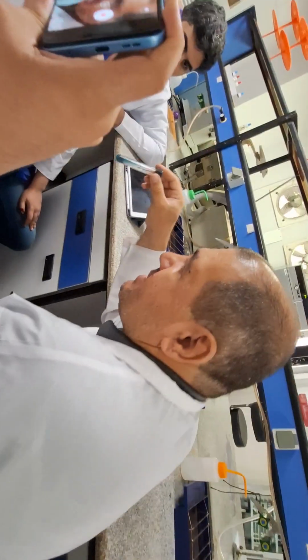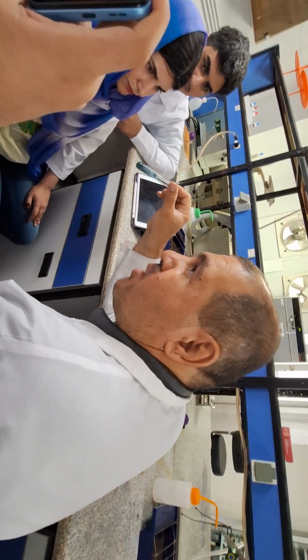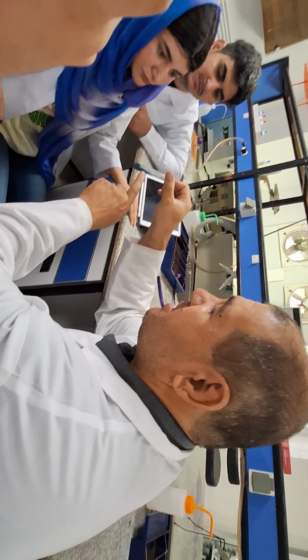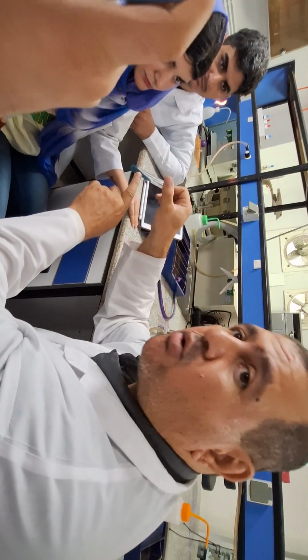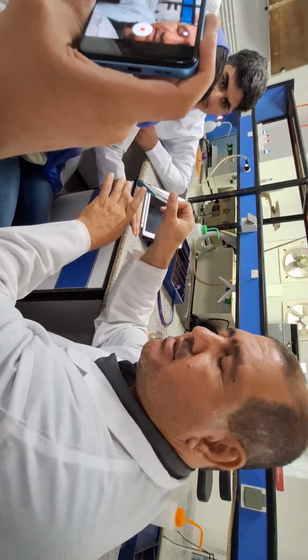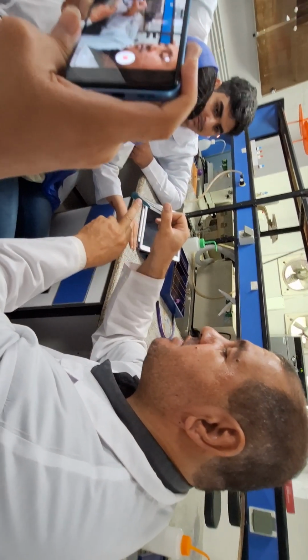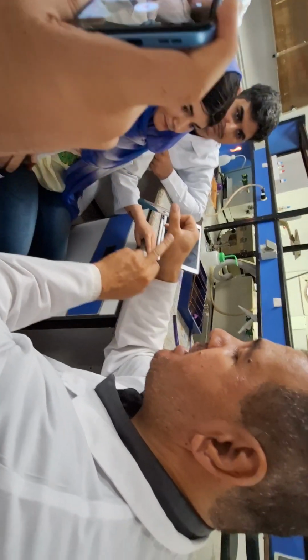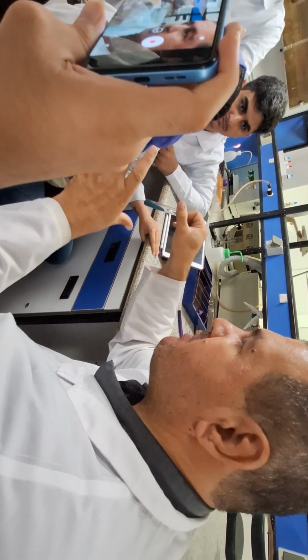And this medium is Simmons citrate, used to identify different species of enterobacteria. Simmons citrate or citrate utilization test. In this medium, we check the ability of microorganisms to use citrate as a sole source of carbon.